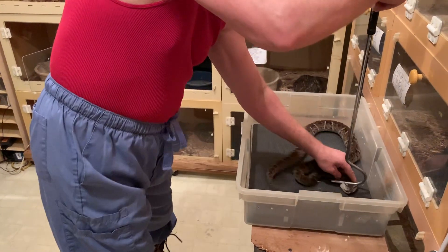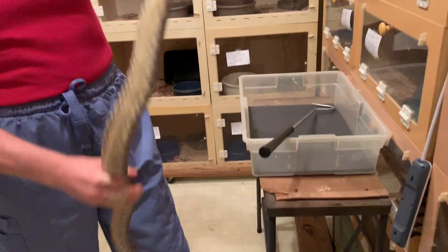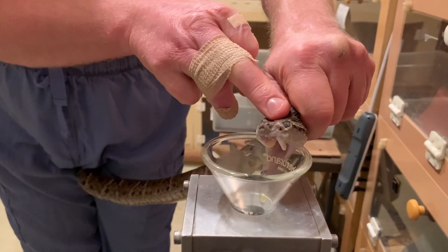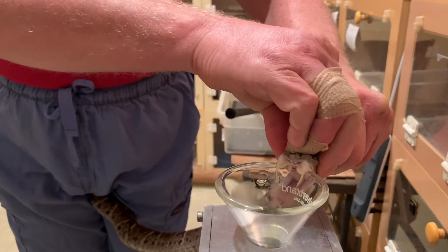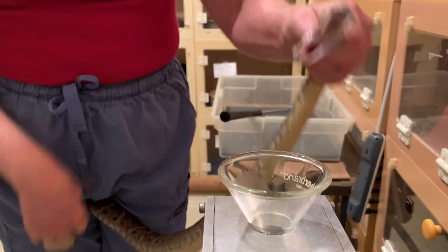Lancehead Vipers in general are strong, wiry snakes, so they have a lot of movement. And you can see they have decent sized fangs there. They have a pretty good strike range, so they really can be a dangerous animal just because of their agility.